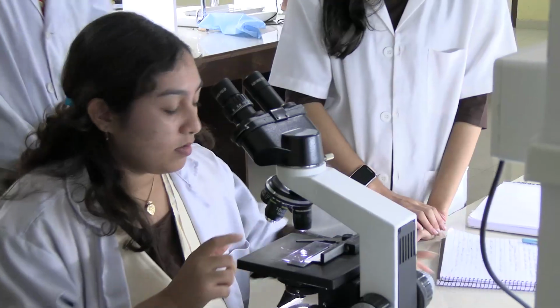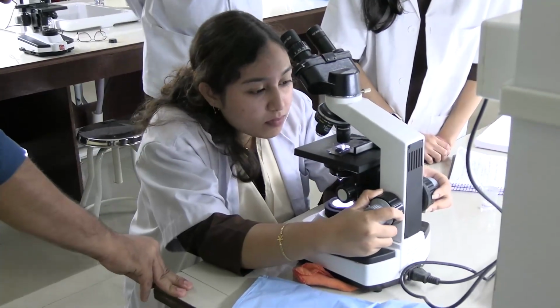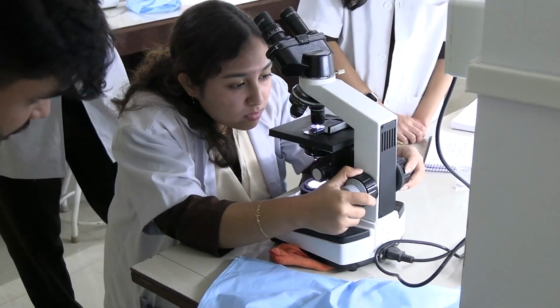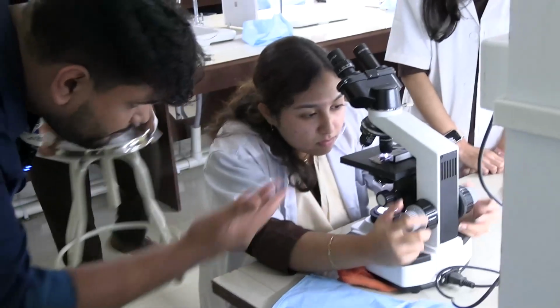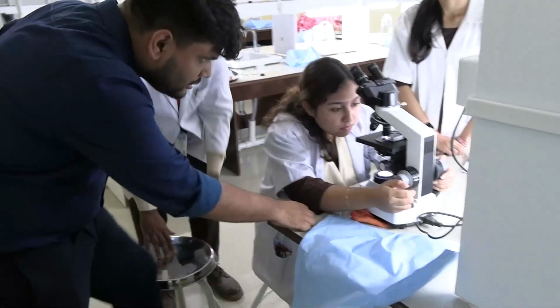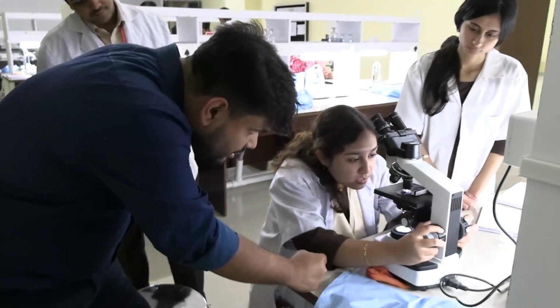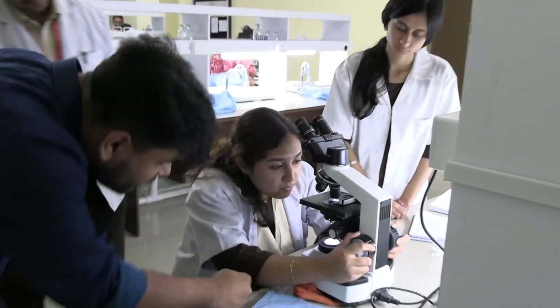You can take it back. Is this the area you want to focus? Okay. So take it all the way up slowly so that it touches the oil layer. A little bit up. No, it's okay. A little bit up until you find some resistance. Okay. Take it a little bit up. Okay, I think that's enough.